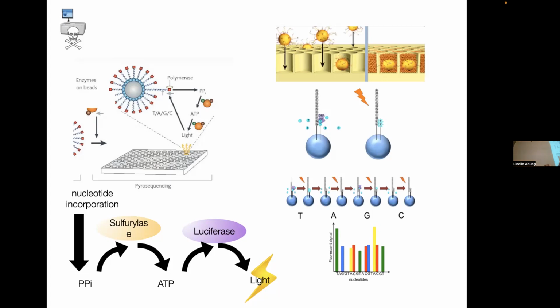But that was great sequencing compared to Illumina at the time, not for the throughput, but for the read length. You could reach 1 KB sequences. So very similar to Sanger sequencing, and very high quality too. So it's a dead technology.